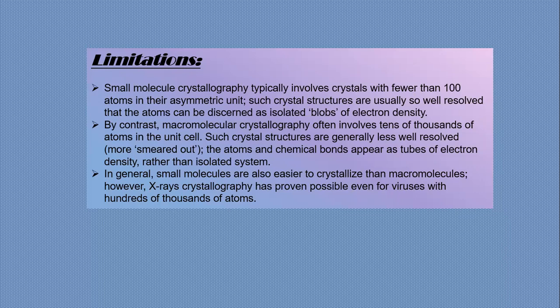In general, small molecules are also easier to crystallize than macromolecules. However, X-ray crystallography has proven possible even for viruses with hundreds of thousands of atoms. These are the limitations of X-ray crystallography.